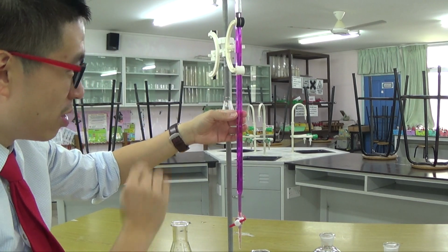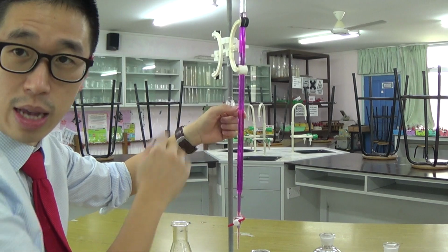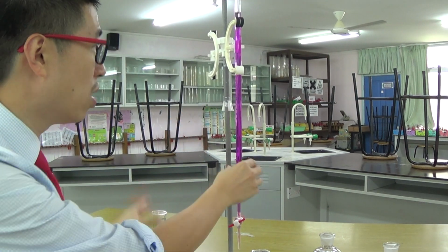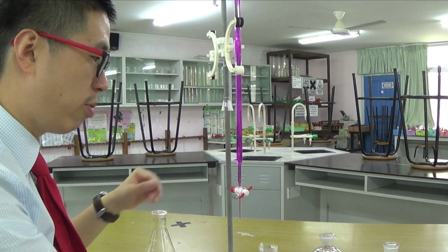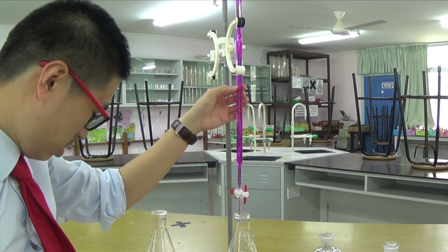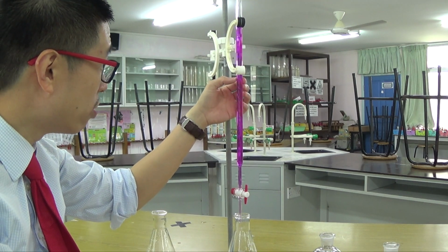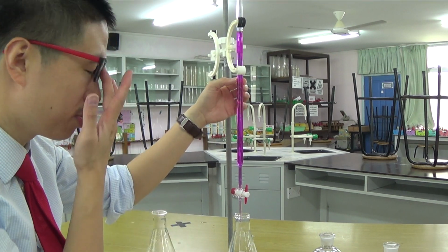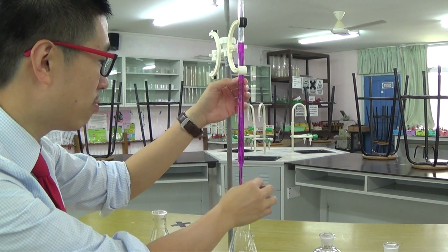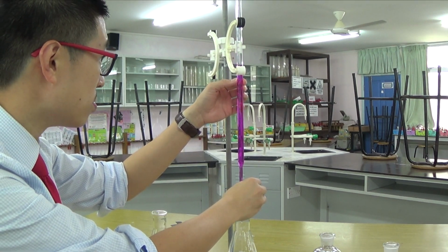But I don't want to only slow down at 38.5. I want to slow down maybe at 37, and then I can do drop by drop. Because I know I already took away like 1 cm3 there. So I was supposed to end at 38.5 with the exact titer, but I will stop when I reach 37 degrees Celsius. Not degrees Celsius, 37 cm3. I will stop. Then I will do it drop by drop.